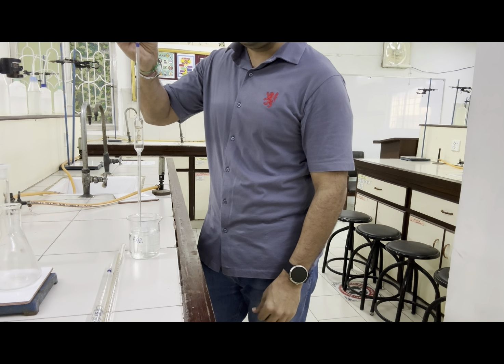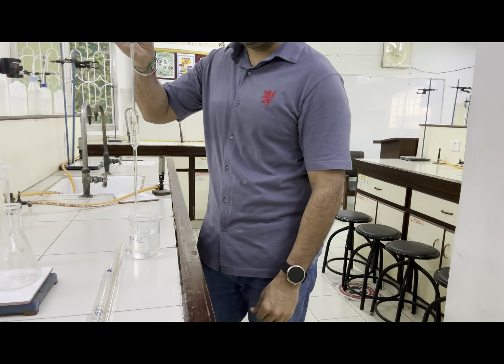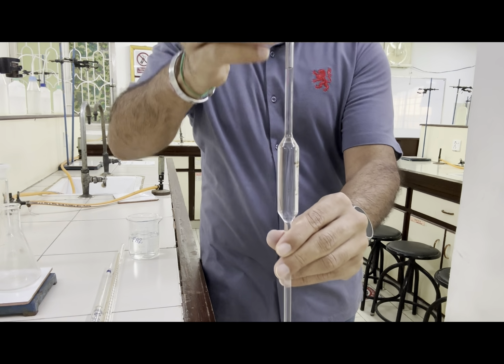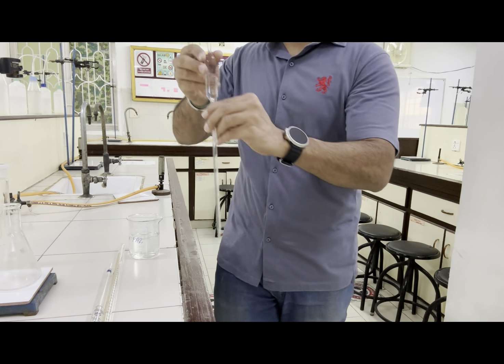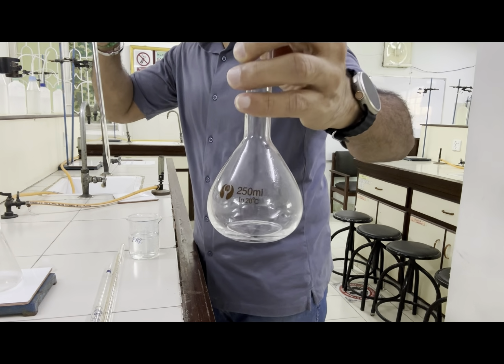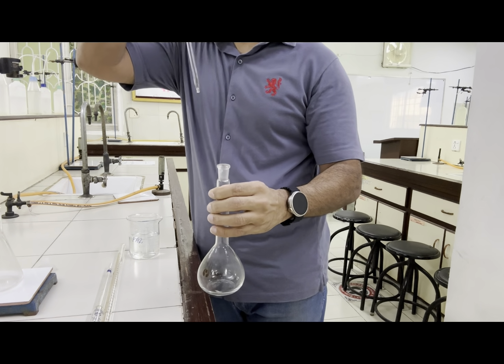So as soon as you fill the liquid up to the mark, and remember, every time you have to take the lower meniscus. Now you can see I have taken the liquid up till the mark. Let me transfer this into this volumetric flask, the 250 centimeter cube volumetric flask given. So let's transfer our solution in this.